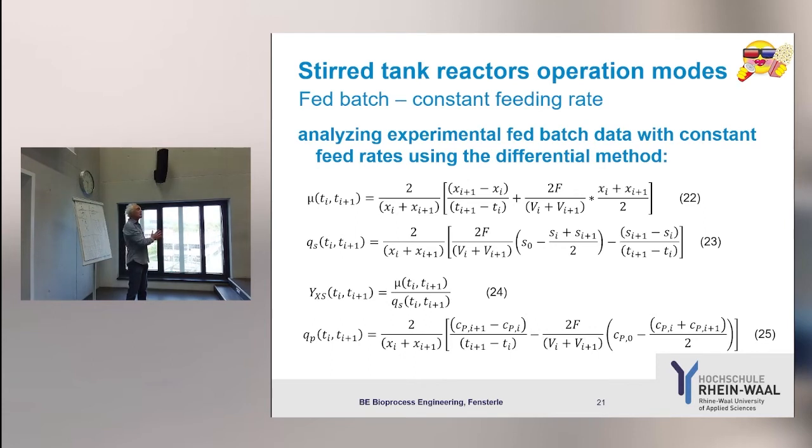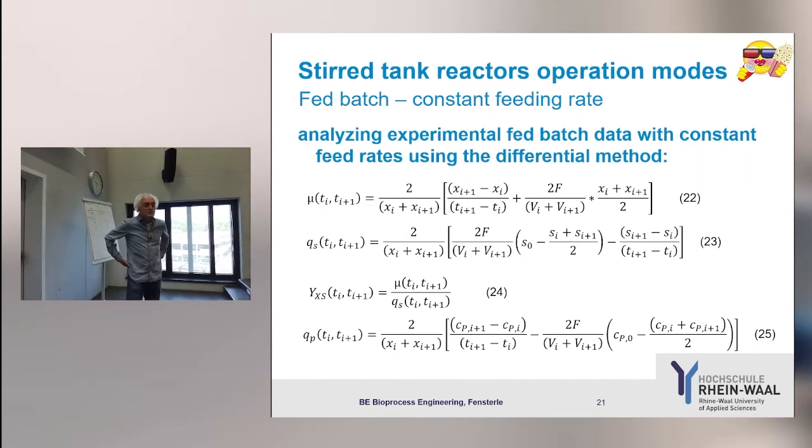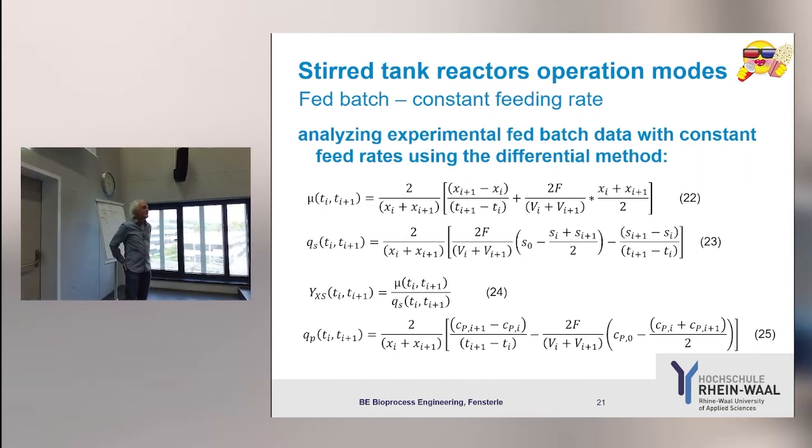Is it then better to take 5 minutes as an interval? Better than an hour? Better than what? Better than a half-hour interval? So I said, who says yes, it's better to take a 5-minute interval? It should be better to take as small an interval as possible. Yeah, so then 1 minute might be even better. Yes, 1 second even better.